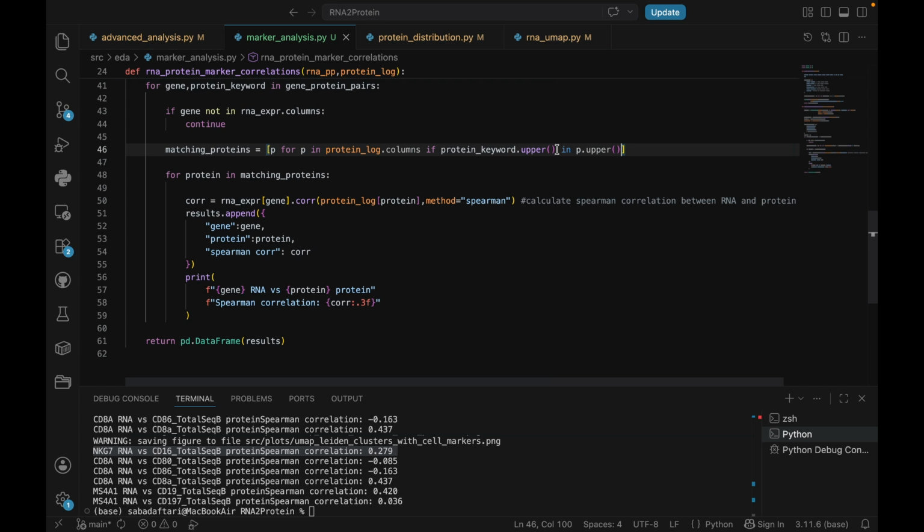So I'm gonna make another case here, plus. And I think that will fix this bug.